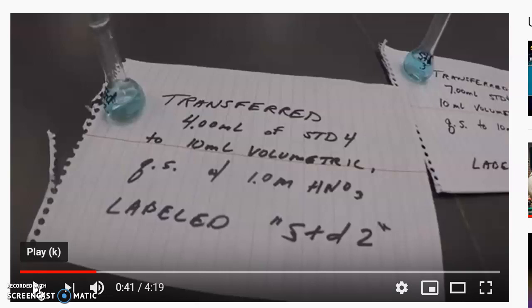From there, you can see that 4 milliliters of that most concentrated standard, number 4, was transferred into this tiny little cute volumetric flask that holds 10 milliliters. It was brought up to the line, so that flask contained exactly 10 milliliters, and now that's our standard 2. Similarly, we did that with 7 milliliters of our concentrated solution and made standard number 3.